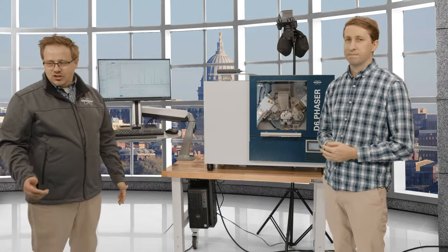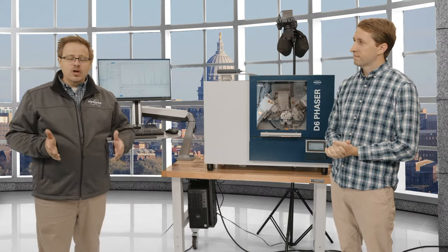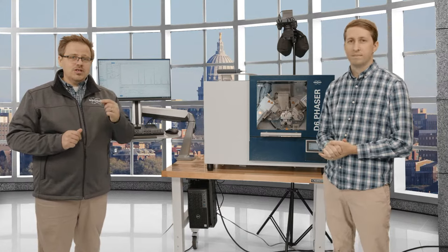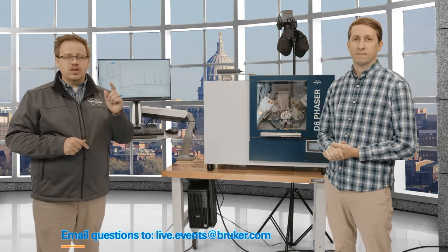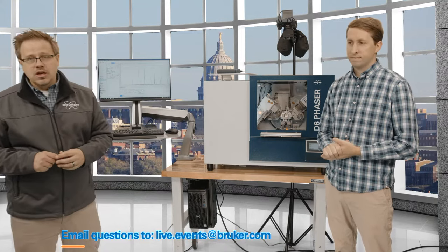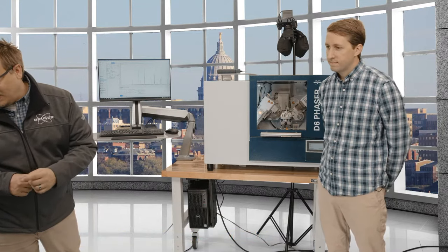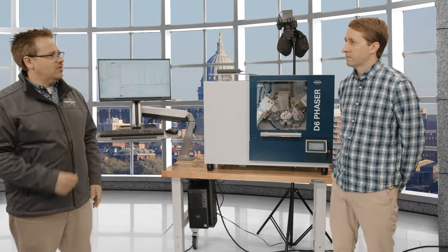Yeah, there we go. So we've got a few questions that came in. If anybody else has questions right now, go ahead and type those in on the right side of the screen. If you are watching this later or you think of something later, you can always send your questions to live.events@bruker.com. Now to get to our first question, which some people sent in before, from Zhang: how often do you top off the cooling water with this 1.2 kilowatt behemoth?